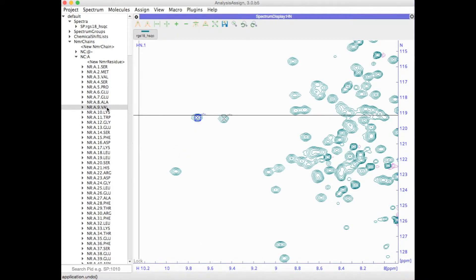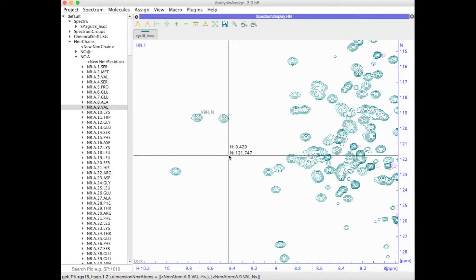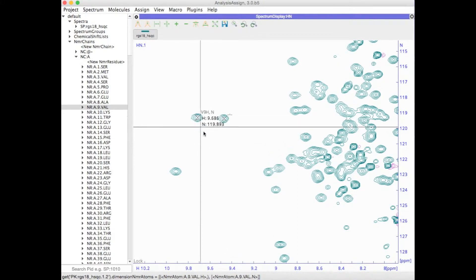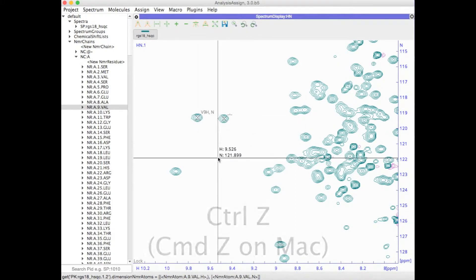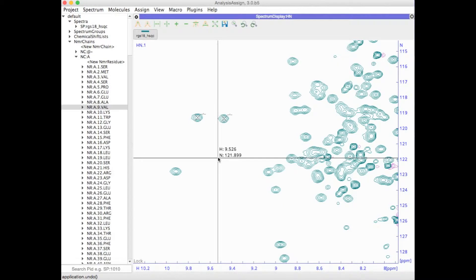Or perhaps you have made an assignment which in retrospect you realize was incorrect. Simply type Control or Command Z and it will undo it.